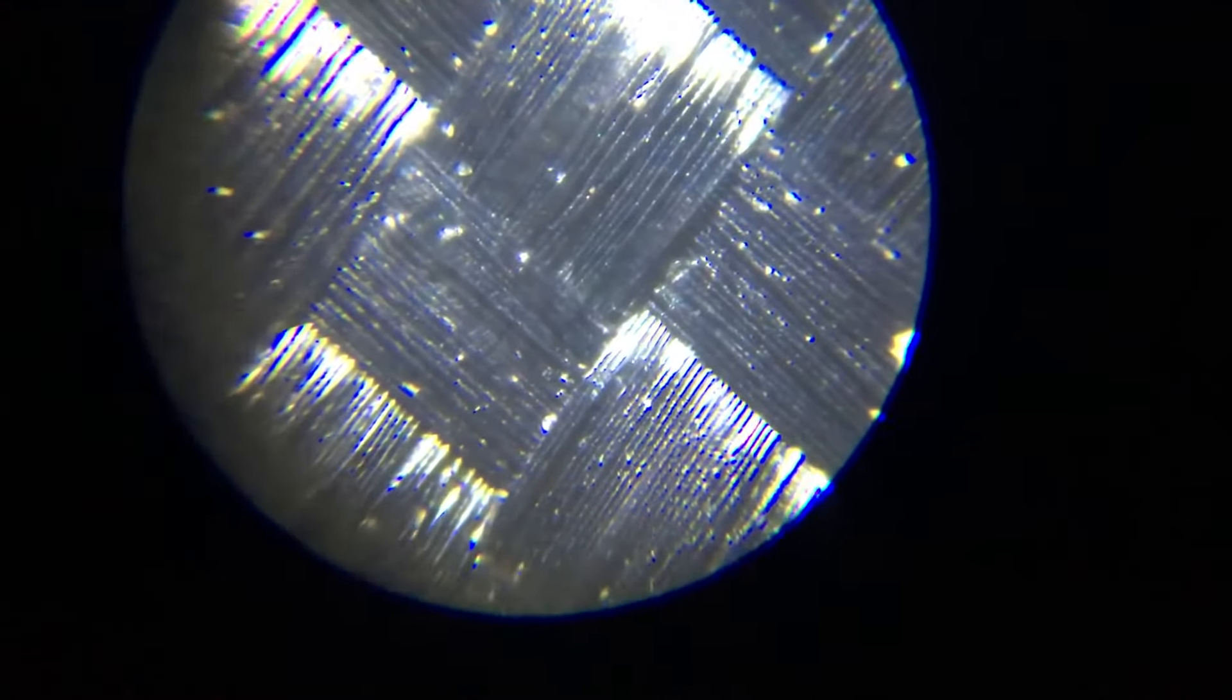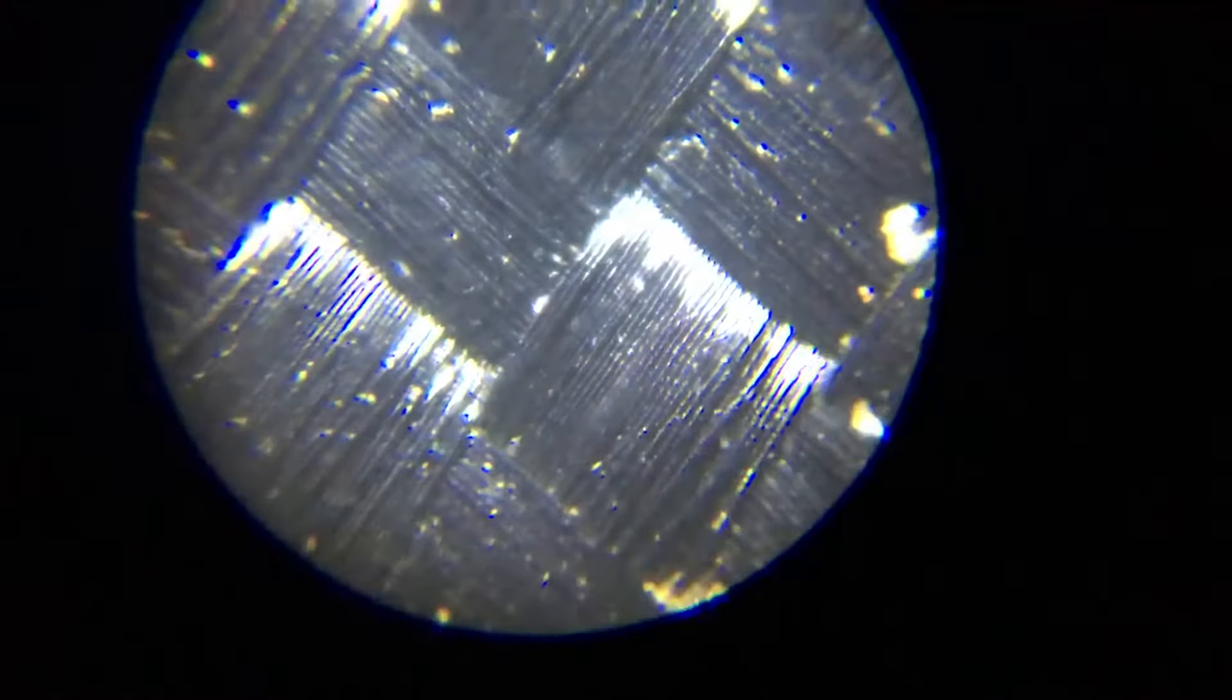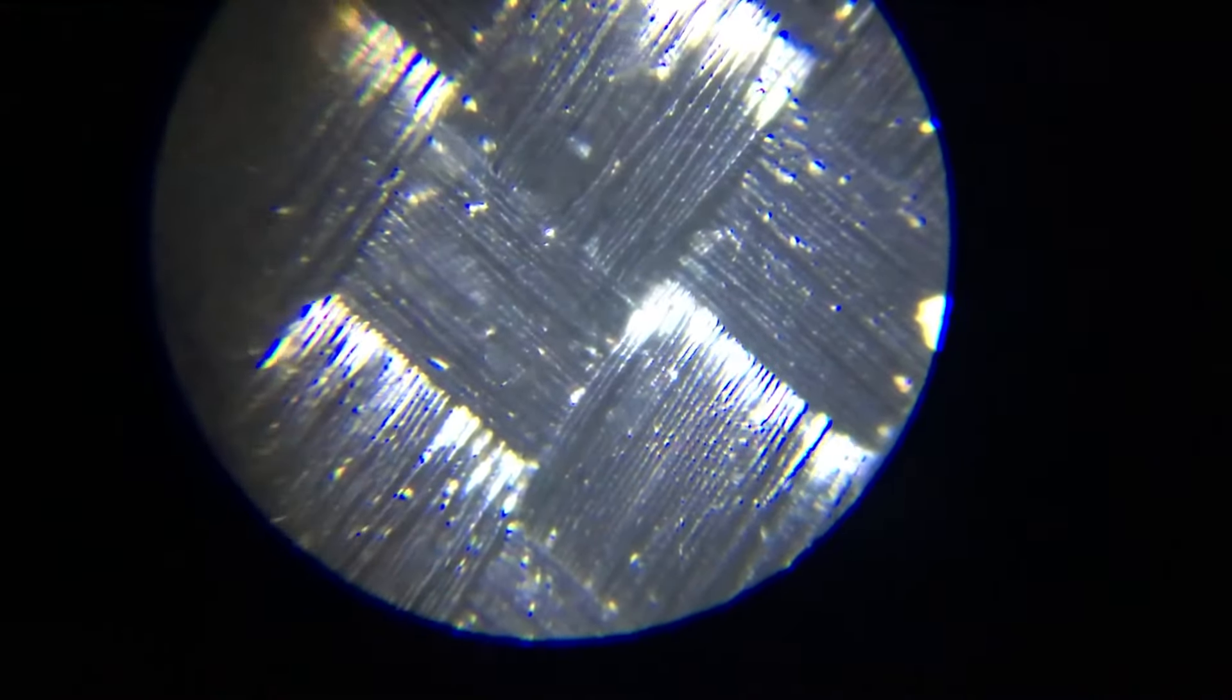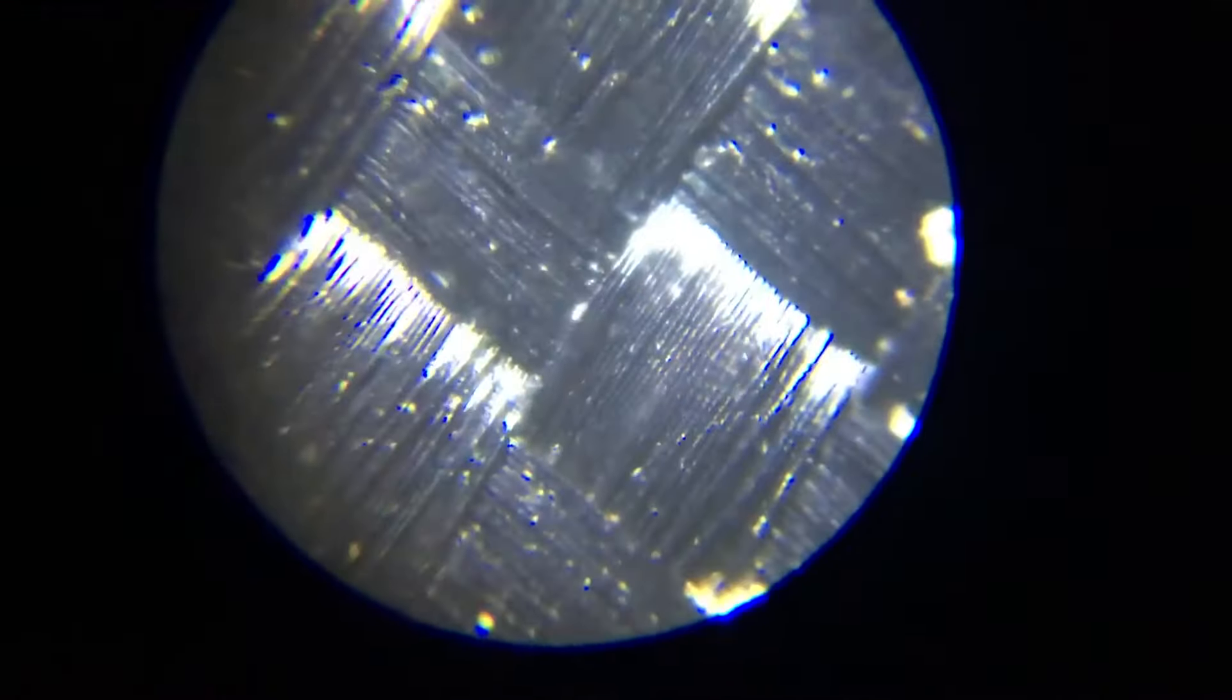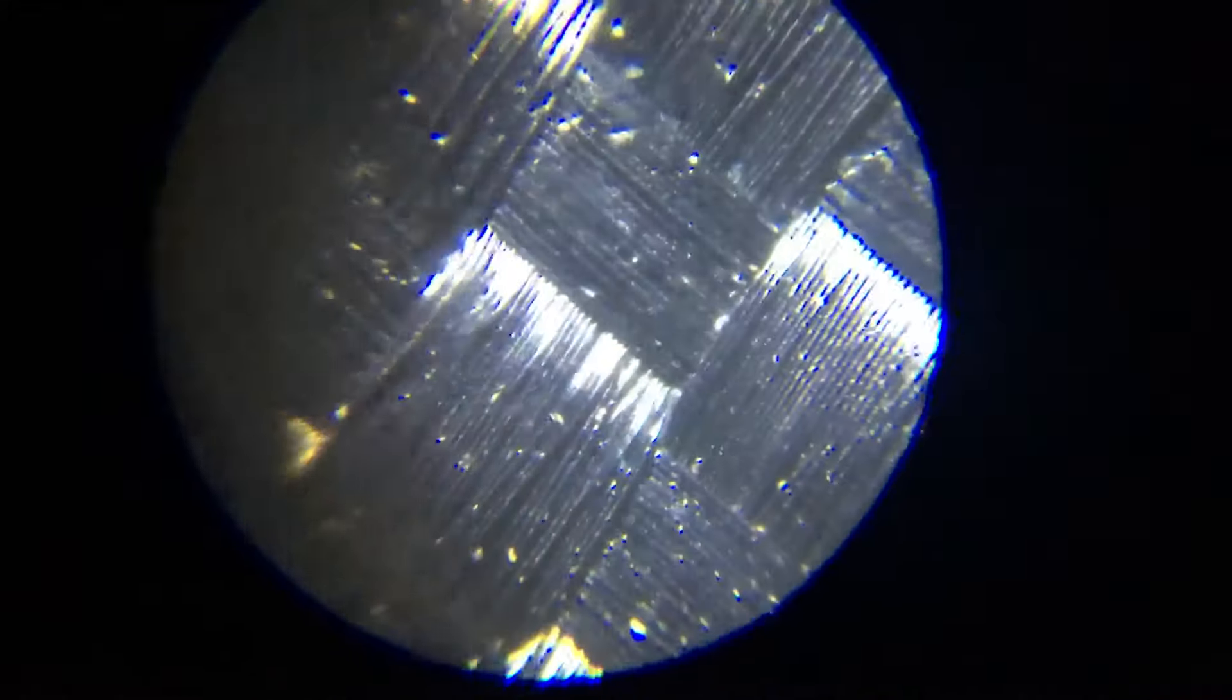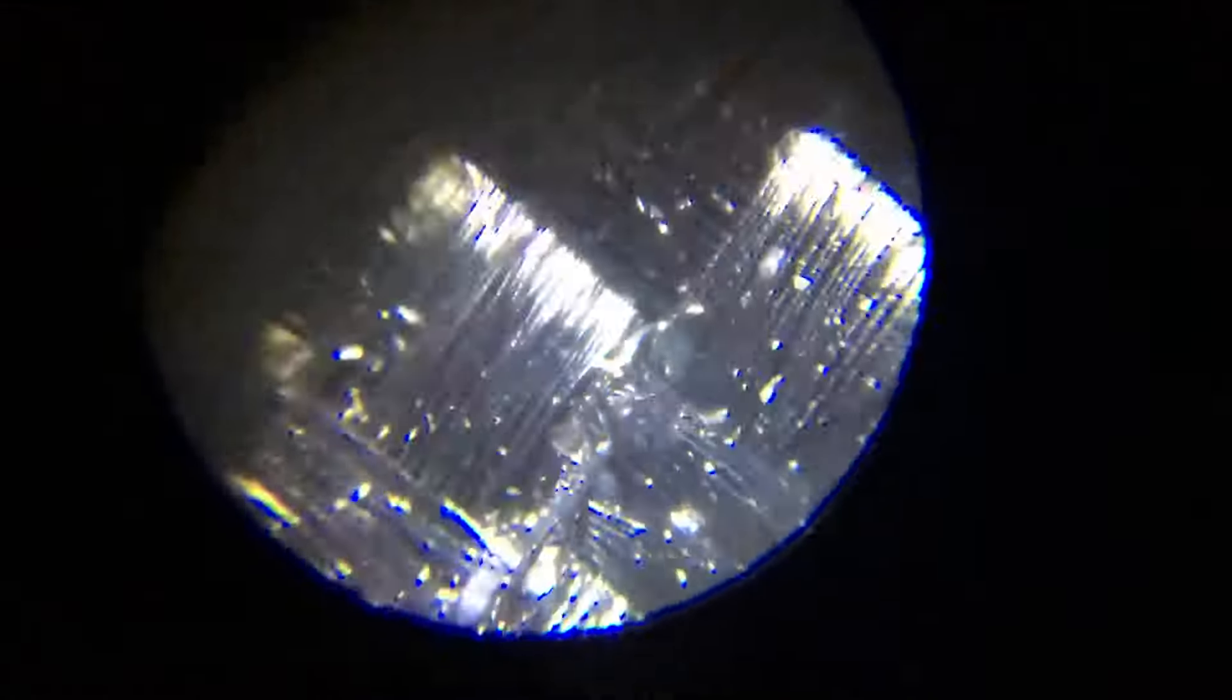Hi, this is the microscope channel and I want to show you this sleeping bag or whatever. What is this called? It's a beanbag chair. I want to show you this beanbag chair fiber really up close in a microscopic way.